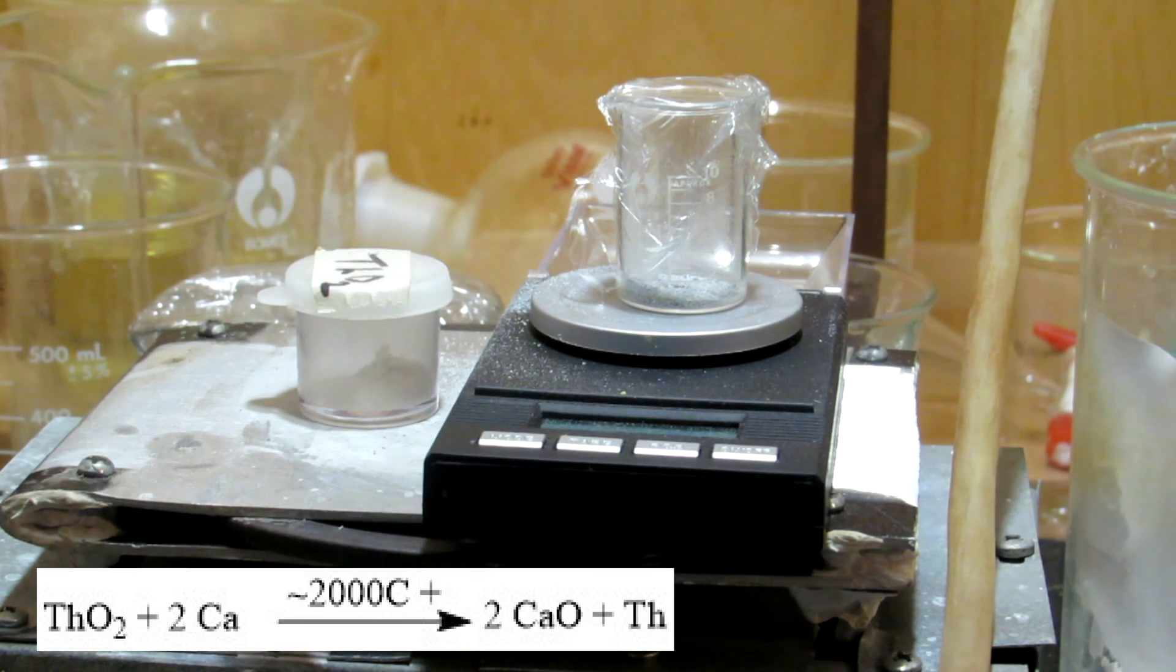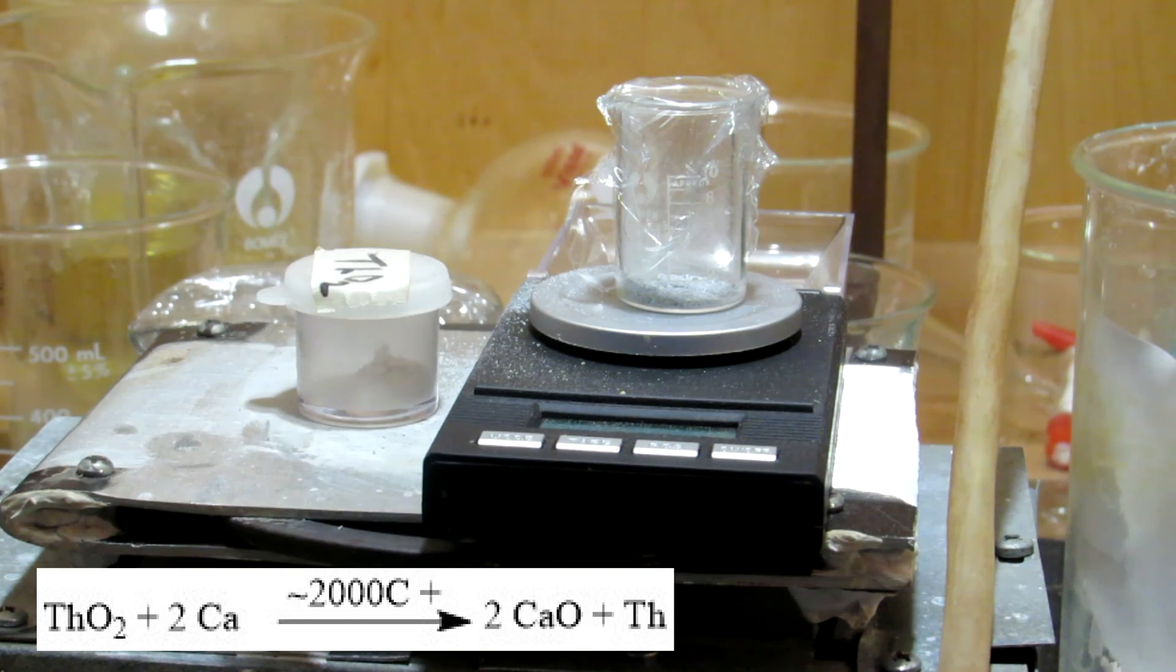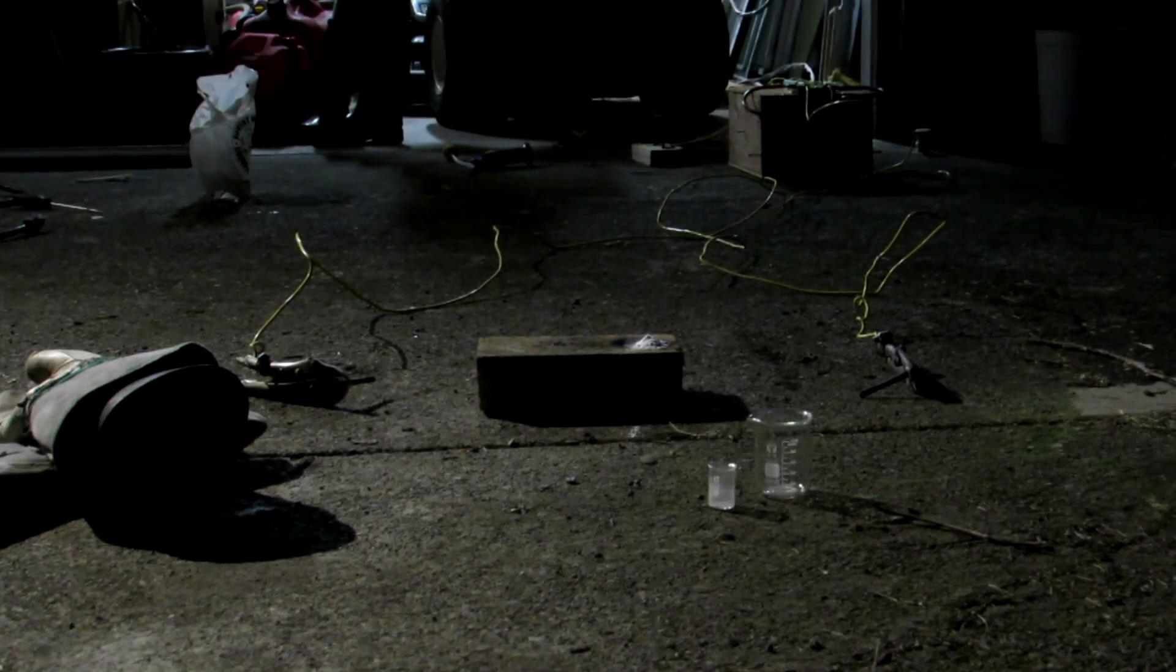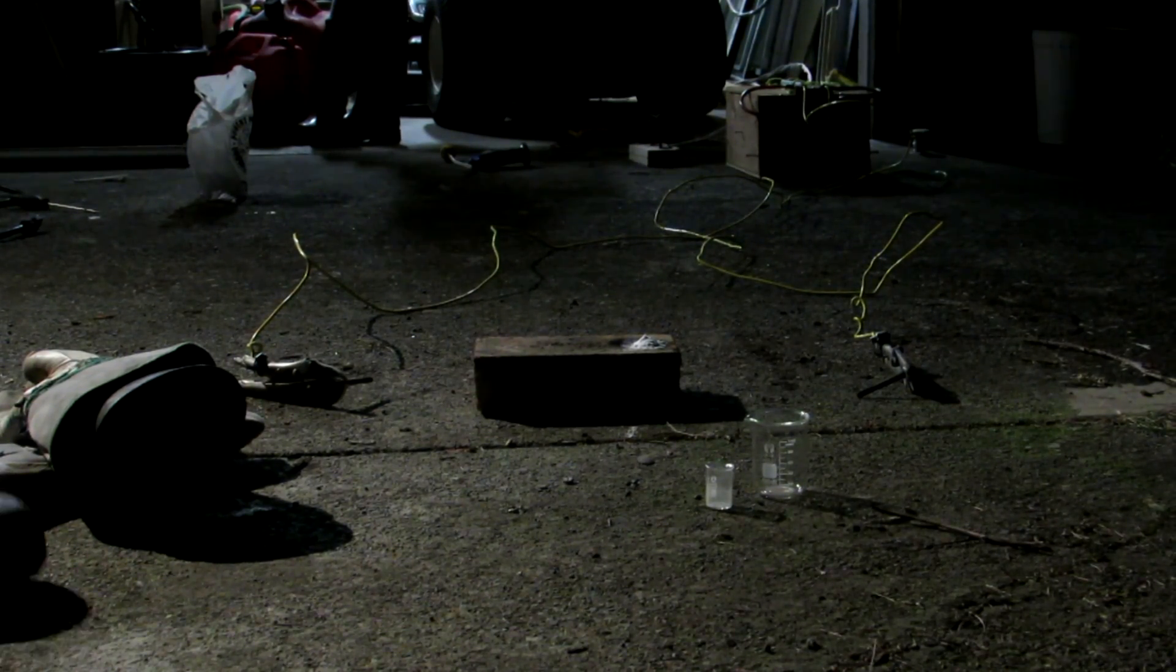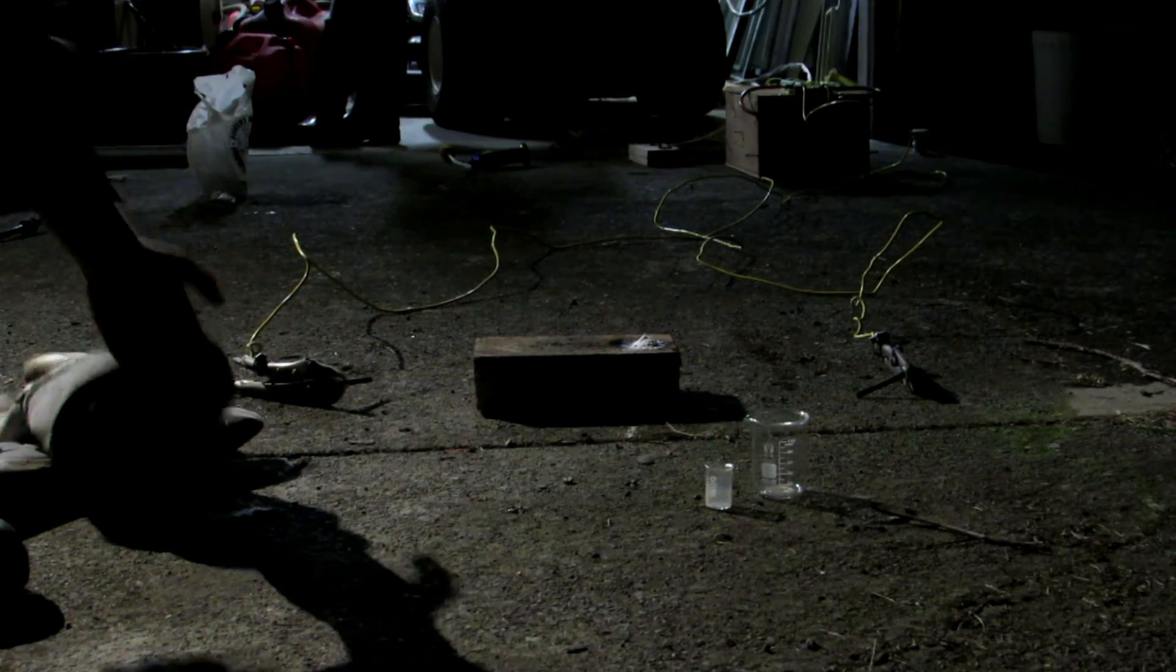To convert the thorium dioxide to thorium metal, we can reduce it with an excess of calcium metal at high temperatures in my homemade arc furnace. The arc furnace was made by rewinding the coils on an old 45-pound iron core transformer that I found behind a dumpster.